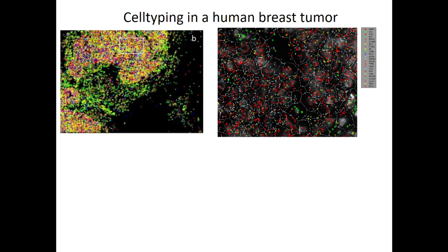So, of course, one can try to make recurrence scores, and we're working on that, but it's actually not completely super simple to convert this bulk scoring approach to a spatially resolved approach. So I think we have to maybe rethink that a little bit. Another thing one can start to look for, just using unsupervised clustering, is to try to define different cell populations among the cancer cells.